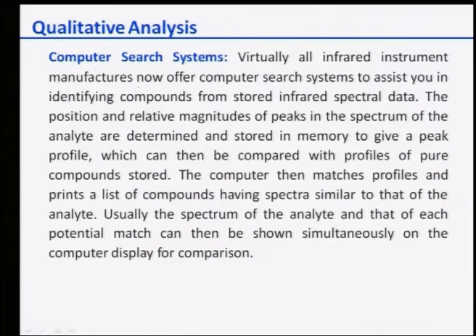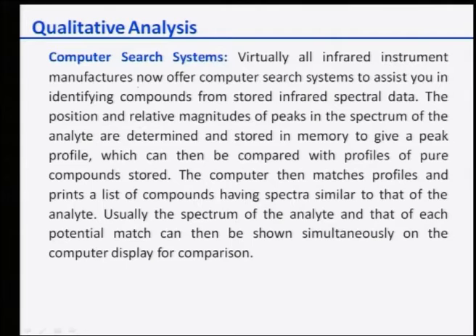FTIR. Well, nowadays nobody uses, or you cannot live without, computers. Therefore, all the qualitative analysis is done with computer search systems. Virtually all infrared instrument manufacturers nowadays offer a computer search system that assists you in identifying compounds from a large number of stored spectral data. This data shows you the position and the relative magnitude of the peaks present in the spectrum of the different analytes, which can then be probed later on.